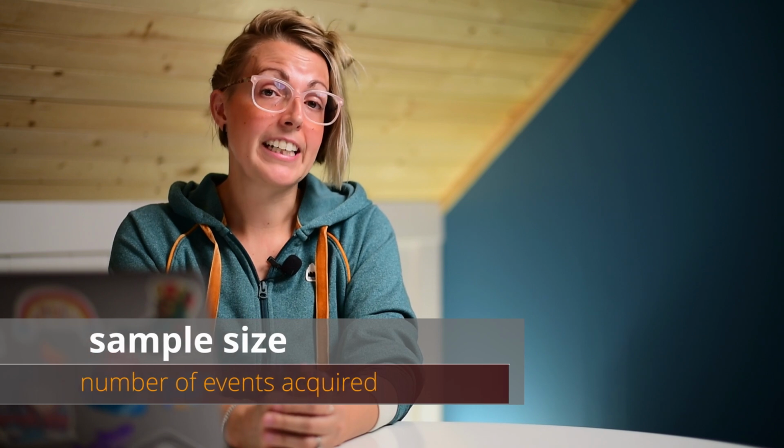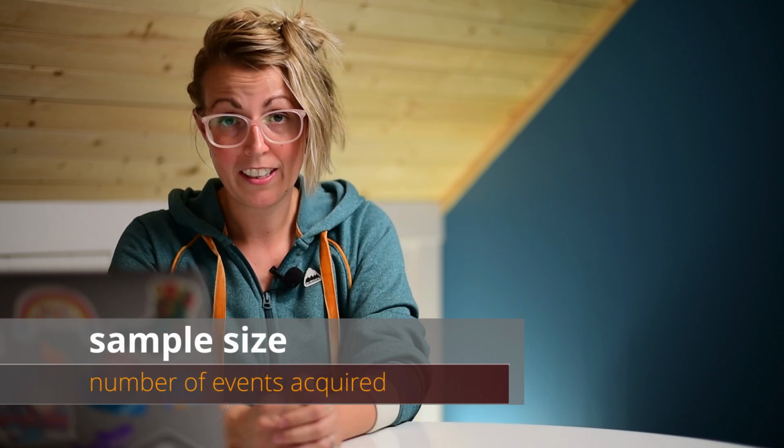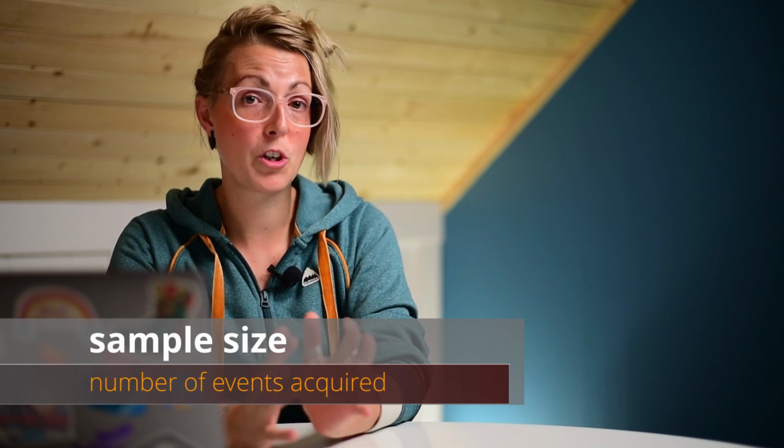And so for a reviewer or a reader reading your paper, it's important for them to understand that your compensation was done properly so that they can actually assess the findings that you are presenting. And last up for data acquisition is talking about the sample size and number of events acquired. This is important so that a reader can determine if enough events were acquired so that you can have a precise measurement of the population you're looking for.